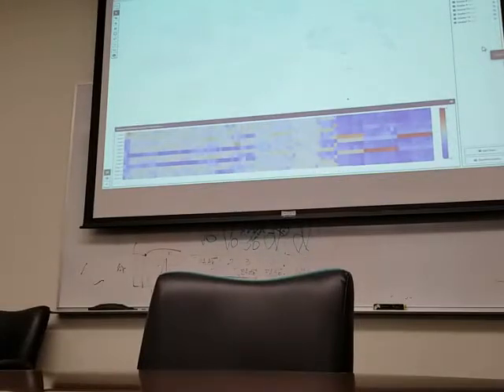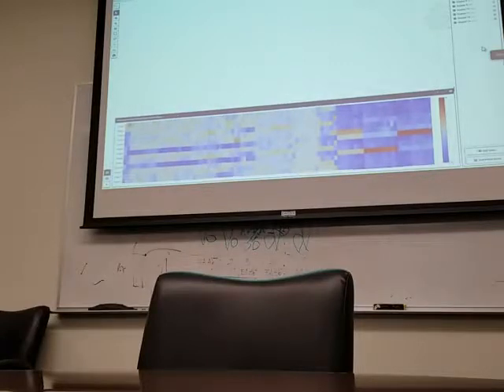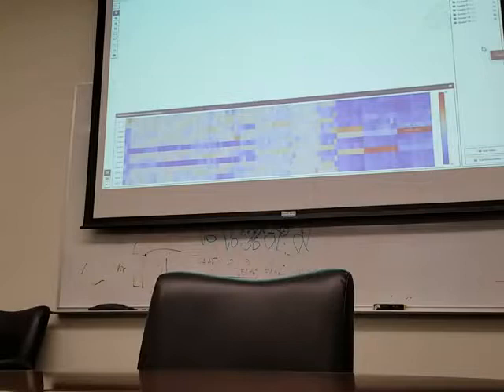Once you mouse over it, you drag it. Can you do that again? Oh, you're dragging it up. You just go right on the edge of it and click and drag. Oh, well, that's what I'm talking about right there. That's good, because then you can see.